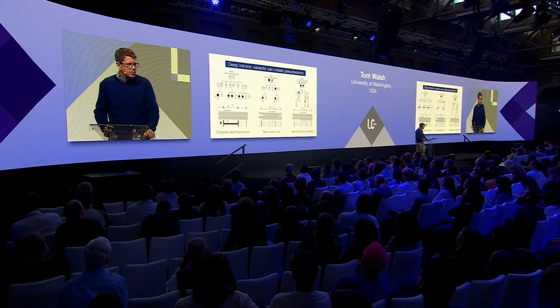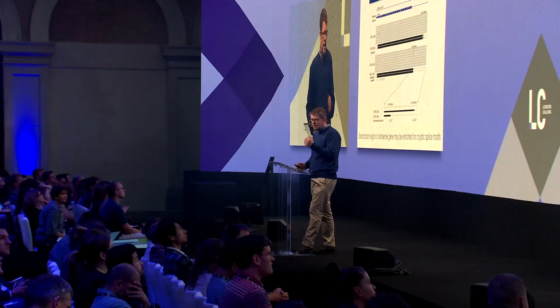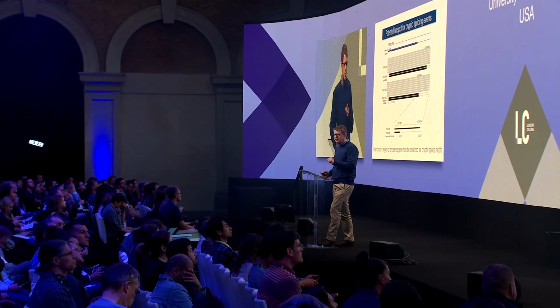So we looked more closely at the ATM literature, and there's actually a third variant on ClinVar between these two variants. So that's 3 pathogenic deep intronic variants within about 30 bases. So we thought this might represent a hotspot or a clustering. So we looked more closely at that specific region. And I'm showing here the 2 variants that we identified. The third variant is between these.